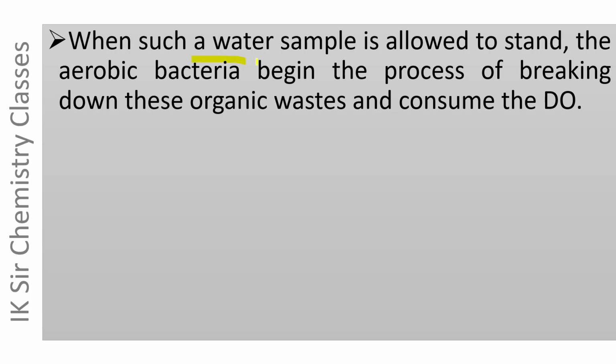When such a water sample is allowed to stand, the aerobic bacteria begin the process of breaking down these organic wastes and consume the dissolved oxygen.